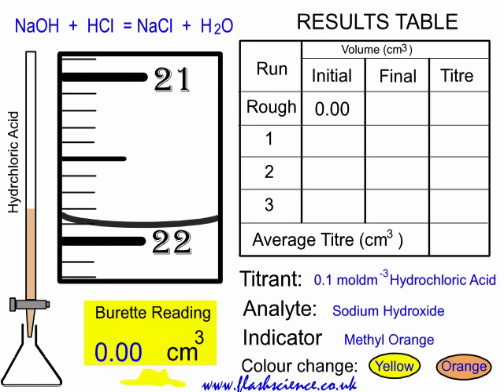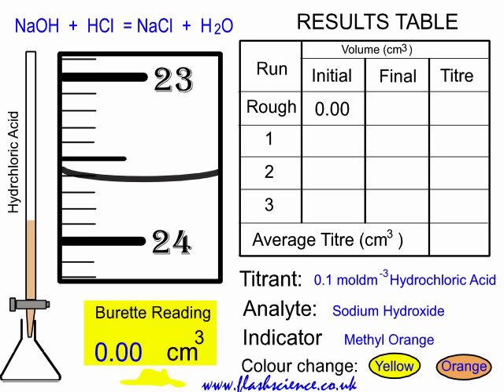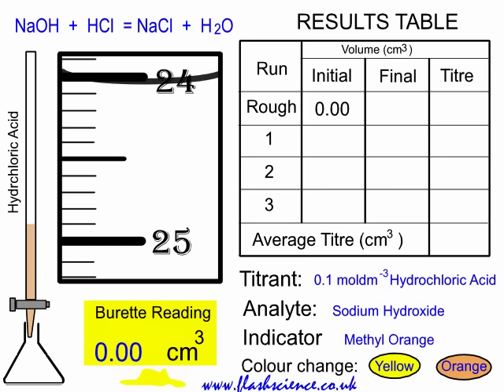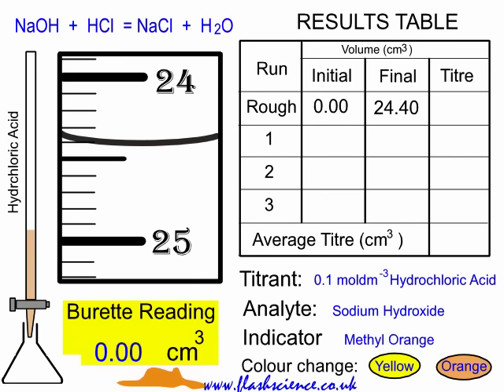As you begin to approach the end point, you'll notice it go from yellow to orange a little bit, but then go back to yellow. Eventually it'll go orange and stay orange, and at that point you should be ready to turn off the stopcock. We read the bottom of the meniscus — you can see here it's on 24.40. So we recorded the initial and the final readings, and our rough titer is 24.40.